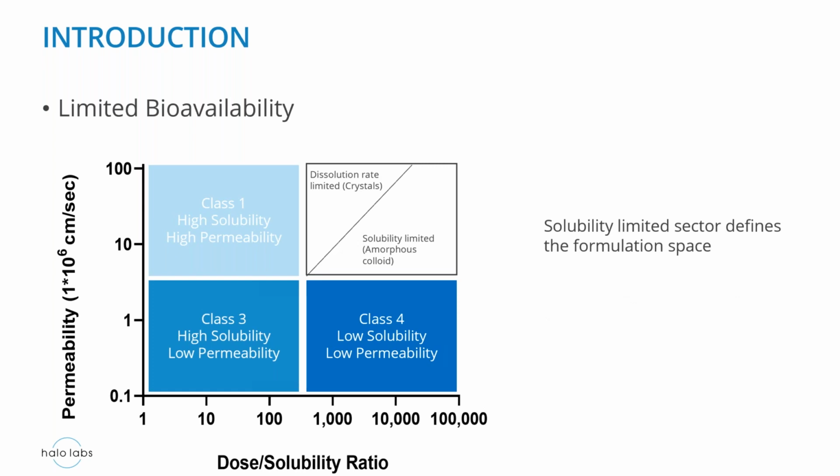Most drugs can be solubilized if you have a good system to quantify solubility. And one thing of interest is that in this class, you have a phenomenon that if you see crystals, this becomes a dissolution rate limited process. Unless you want something that is rate limited dissolving inside the body, you don't want this. You don't want crystals.